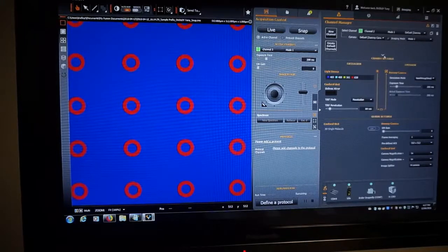Okay, so this is a feature of IQ, this distinguishing idea of channel settings and global settings. So global settings, like the name implies, are things that apply to every channel that you can control. Channel settings are parameters that are unique to the channel. Okay, and like in IQ, Fusion allows you to define whether a parameter is a channel setting or a global setting, and I will show you how you change those.